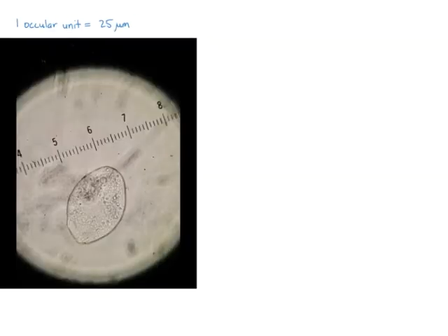Hey everyone, today I'm going to show you how to add a scale bar to your biological drawings. The first thing you want to do is figure out the size of one ocular unit.